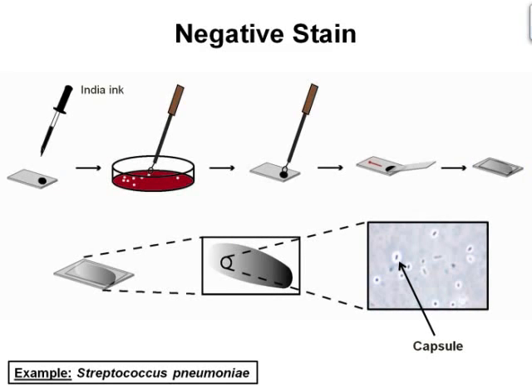An alternate to using the basic positively charged dyes such as methylene blue and crystal violet is to use acidic, negatively charged dyes such as nigrosin or Congo red. They are repelled by the negatively charged cytoplasm and gather around the cells, leaving the cells clear and unstained. This technique is called the negative stain technique, which is illustrated in the figure.